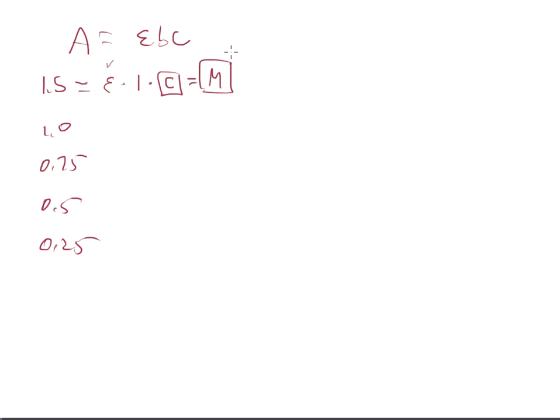Now, I will almost guarantee you that if you try to make that standard, and you're like, okay, well, that's my strength. That's how strong I need to make that standard. So let me use the molarity formula to give me moles over liter. And let's say that I want to make 100 mLs of that standard, right? Maybe. So that's okay. So whatever value that I get here, that's the value that I'm going to use for my molarity equation. That's the strength that I need to make.